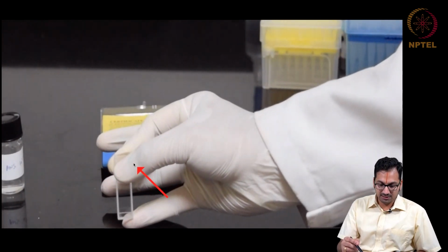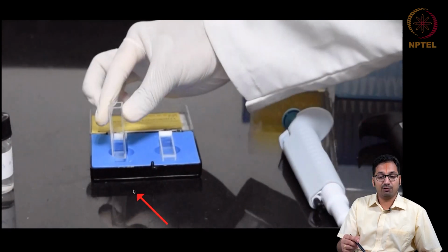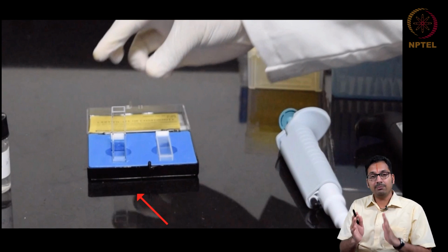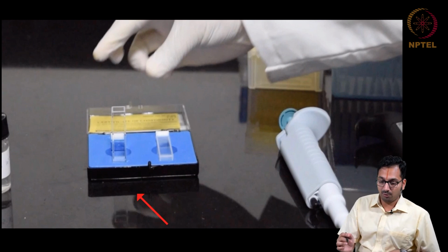As you are able to see, the cuvette is transparent on all the sides, as this is a fluorimetric measurement. If you are doing a spectrophotometric measurement using a UV-visible spectrophotometer, you would have cuvettes that could actually be only transparent on one parallel set of planes, not the perpendicular ones.